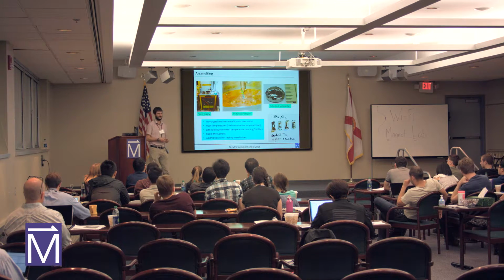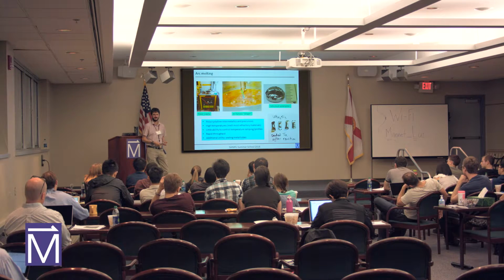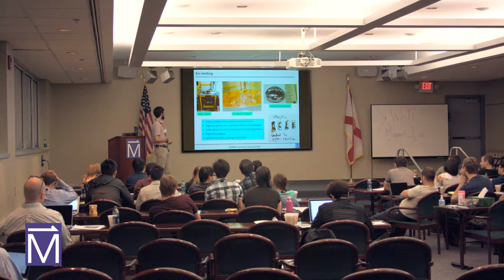So even though you heated this thing to 4,000 degrees C, and then you let it cool at an unbelievably fast rate. I mean, this thing is sitting on a water-cooled hearth, so it goes from 4,000 C to about 800 C in a fraction of a second. So even though it cooled that fast, it still forms grains. And in fact, in a material like this, you can even break it and extract a single grain that might be a single crystal. So actually, Russian researchers love to do this for some reason. That's been my experience. Okay, so maybe I've dwelled on this for too long, but I really love this technique.